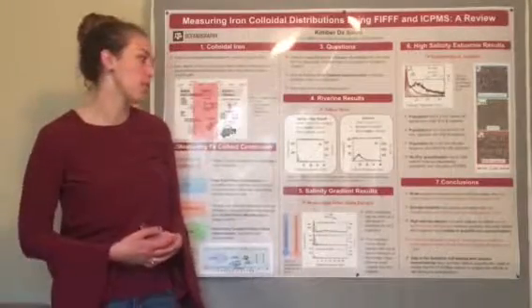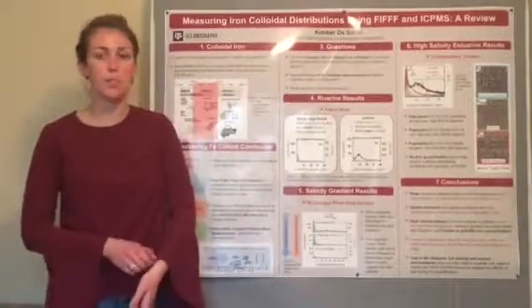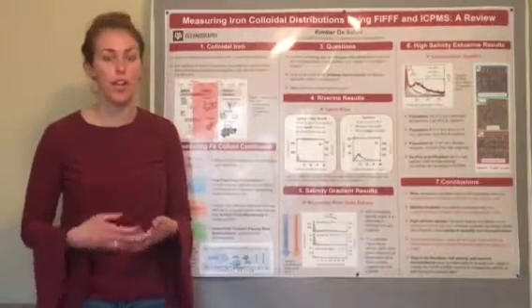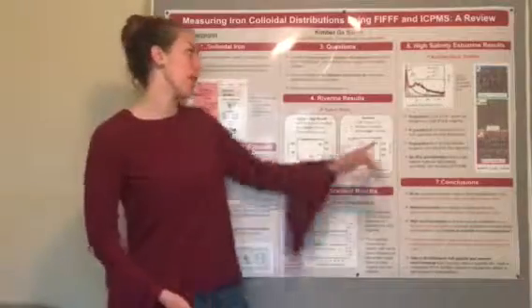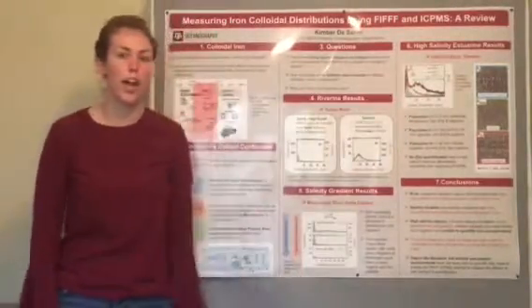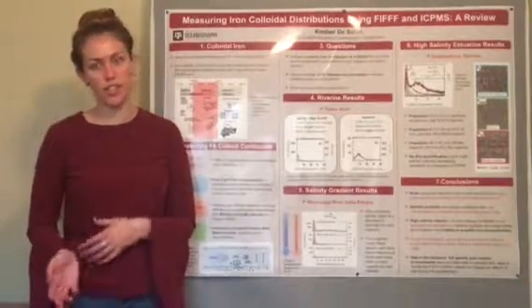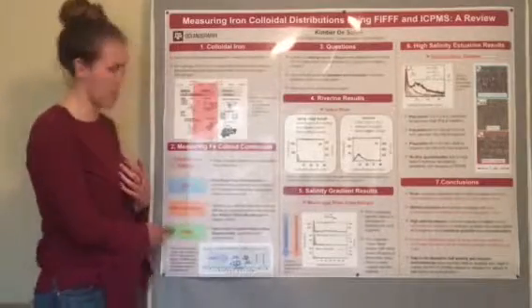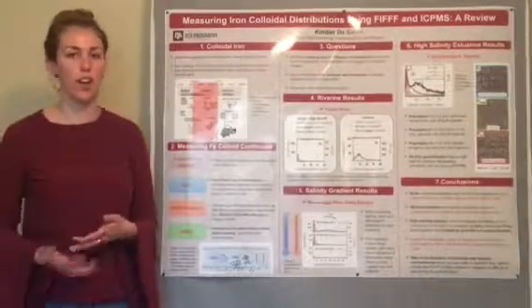So in conclusion, we see that similar pattern where when we have high runoff, we have small organic iron-rich colloids. However, if we look at this figure here, we do not see iron quantified on the y-axis, and that's because the high salt matrices and the high salinity environment samples clogged the ICP-MS, and so they weren't able to get sensitive enough readings to quantify iron.